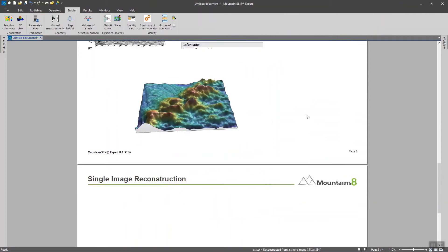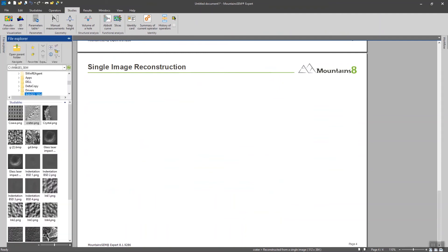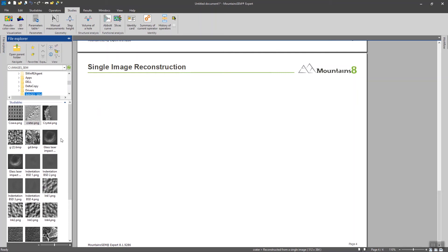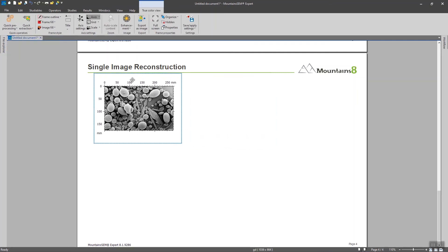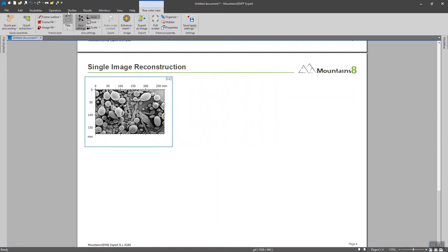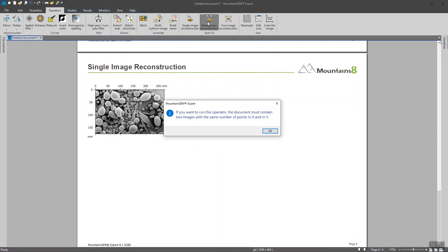And the last example is going to be to use an object as a reference in the image. So again I'm going to load another image and to use the same function.